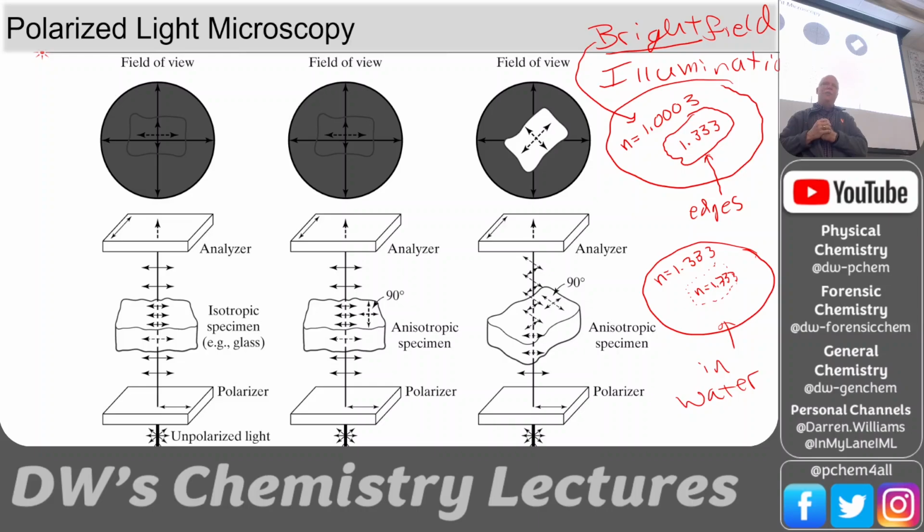Let's say you have a piece of glass from a car crash or something. You have a headlamp. You can pull that in and you can do a non-destructive test in microscopy with these different index matched oils. And when you match the refractive index of that little glass chunk, it'll disappear, which is pretty neat because light's not steered by the edges. It's in something like water, it's going along, it's slowed down by 1.333, and it hits the edge of that glass. It's still slowed down by 1.333, so it doesn't steer to the left or the right. It's not refracted or reflected off.